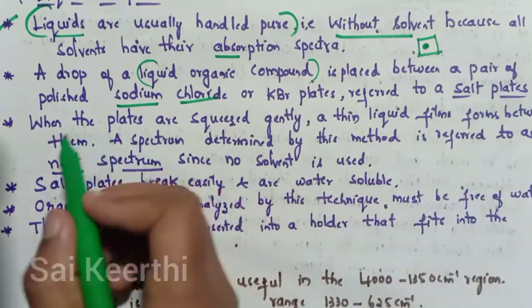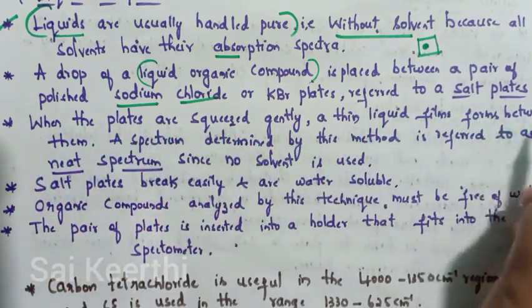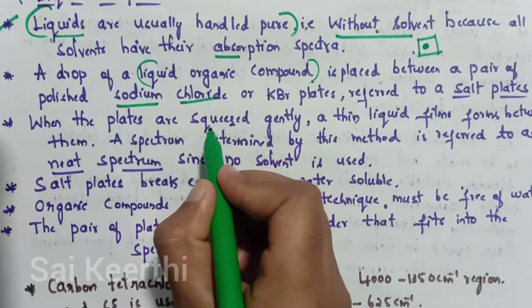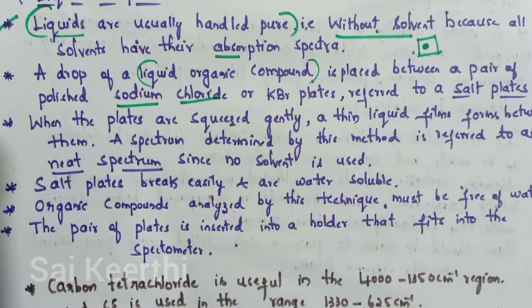And next, when the plates are squeezed gently, a thin liquid film forms between them. If we apply some pressure and squeeze them gently, then a thin liquid film will form between them.